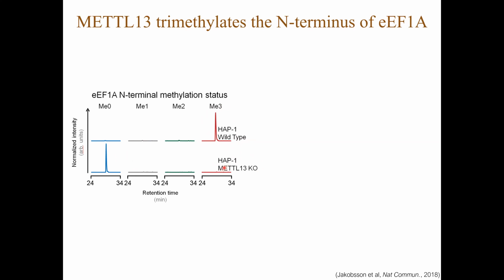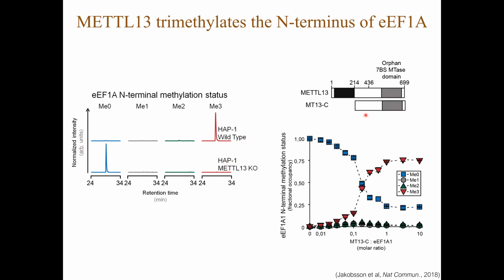But to also provide a direct link between the enzyme and the substrate, I cloned the different domains of METTL13. For one domain, which I here denote METTL13C, I observed that it was capable of methylating the elongation factor substrate in in vitro assays. Here I incubated METTL13C with the elongation factor substrate at different stoichiometries, and observed a dose-dependent methylation of the substrate.